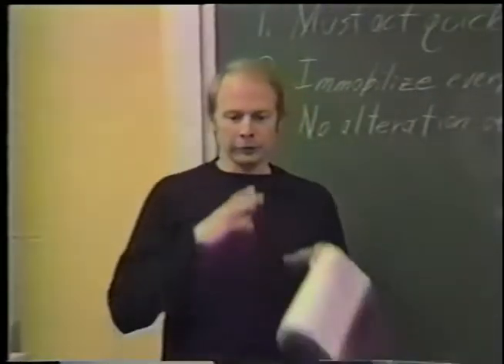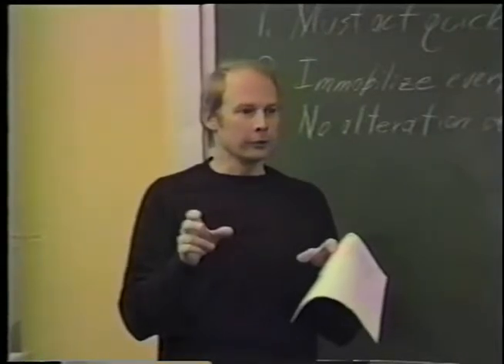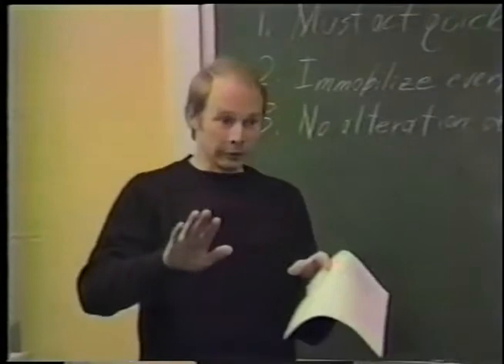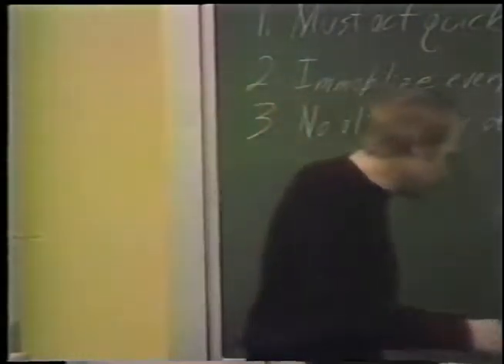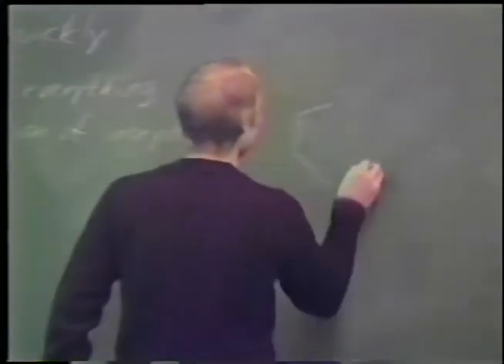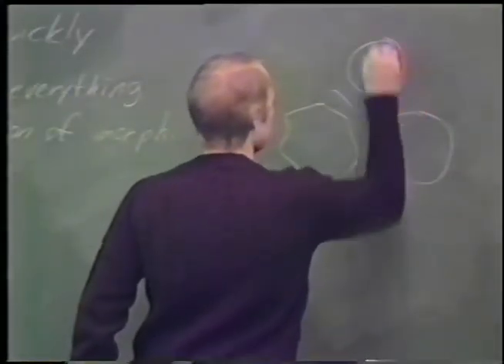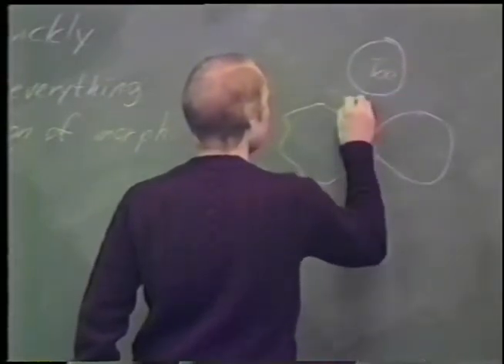So you have domains that are pure ice, and regions around them that have a high solute concentration. They've reached what's called the eutectic composition, at which they're going to freeze, even though the freezing point has been depressed by the high solute concentration. So what you end up with is domains of ice surrounded by eutectic.